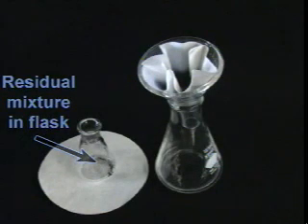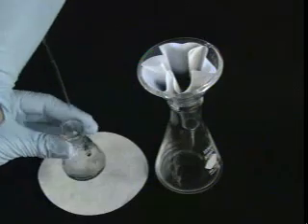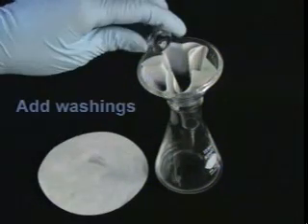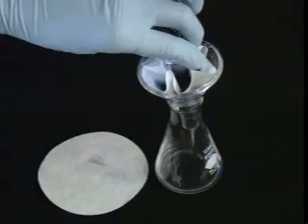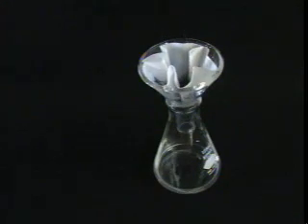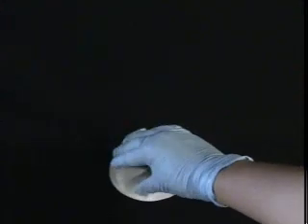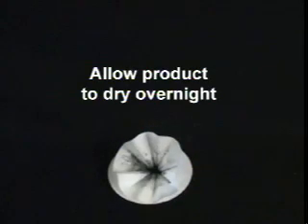But remember, there is always rinsing. Here we can see the residual mixture in the flask. Using a pipette, make sure to rinse your flask with solvent, allowing it to run down the sides and pick up the residual mixture. Then add these washings to the filter paper. Don't forget to rinse the filter paper with solvent as well. You want to rinse your flask and the filter paper three times each. When you think gravity's done all that it can, it's time for collecting the product. If you were aiming for the solid product, take the filter paper out of the funnel and place it on another piece of filter paper or a watch glass, and allow the product to dry overnight.